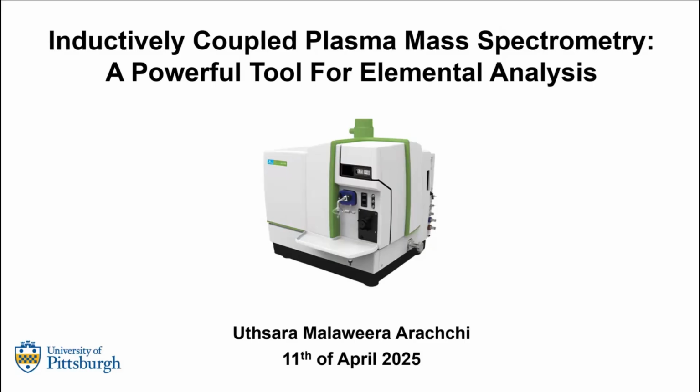Hi everybody, I'll be presenting on the ICP-MS, which is inductively coupled plasma mass spectrometry, and this instrument is a powerful tool for elemental analysis.